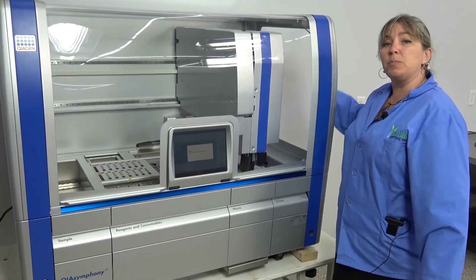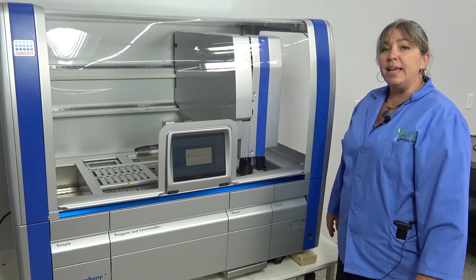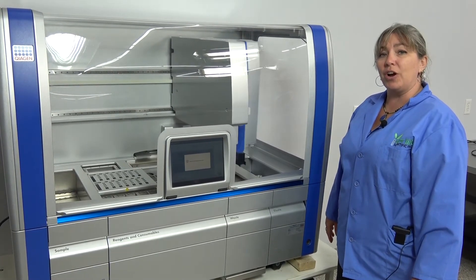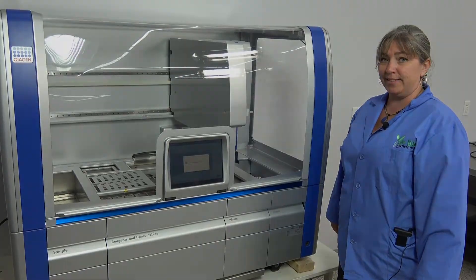This instrument has been fully checked out by our in-house technicians. It is backed by our 90-day warranty, and we do have it on hand in our Cridersville, Ohio facility. Thank you.